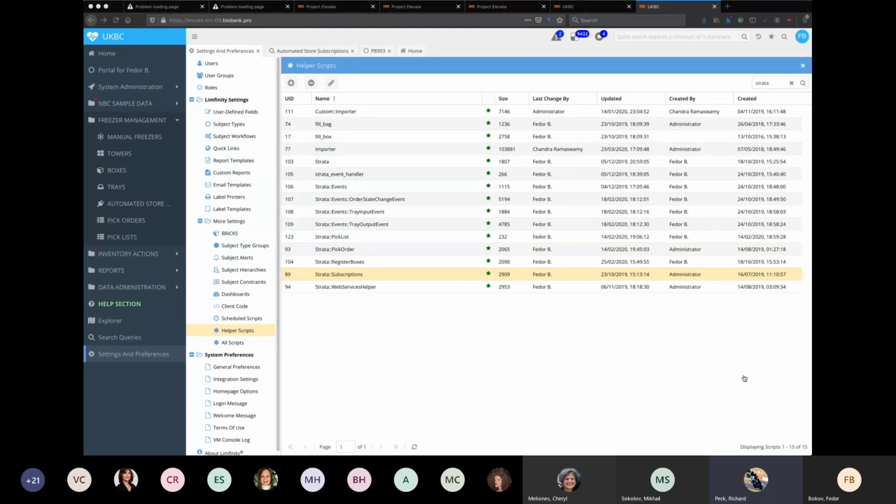As I said, when we were dealing with two different LIMS and migrating from one to the other, this was quite an important requirement, because there were a number of samples in the old LIMS that we hadn't yet put into the new Limfinity system. So does that help? Essentially, we had to map the structure of the freezers and then import them and update the data in Limfinity.